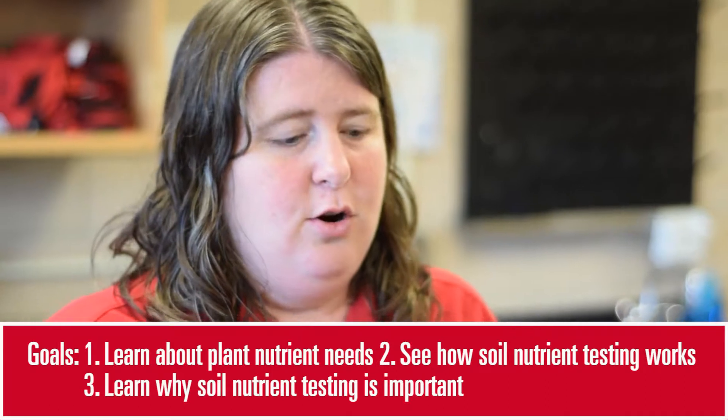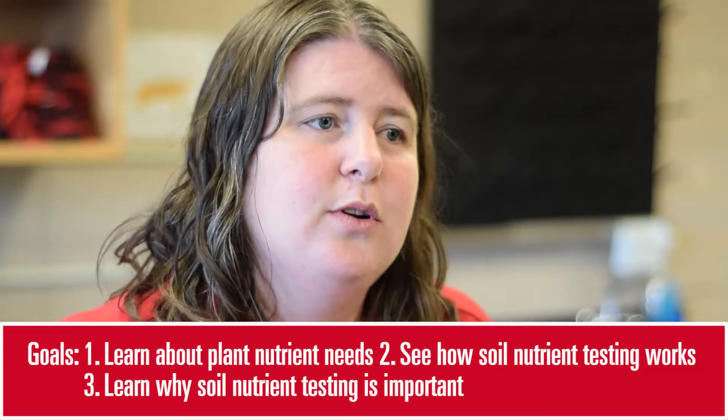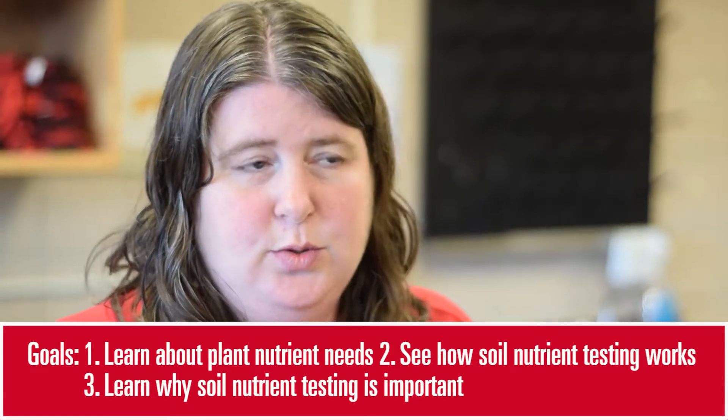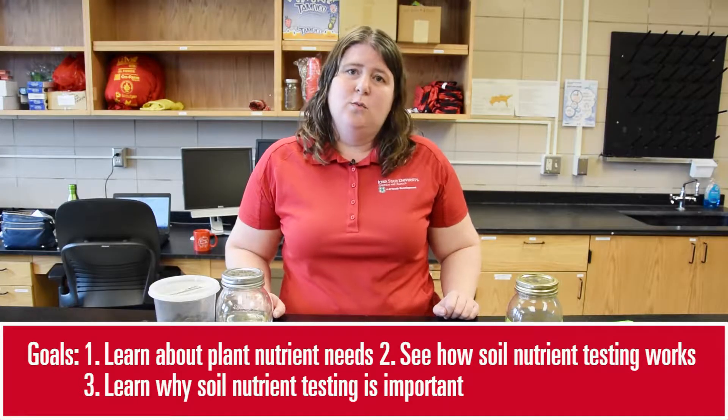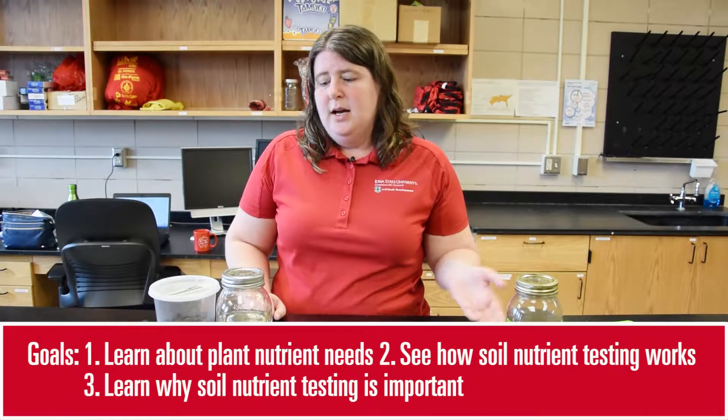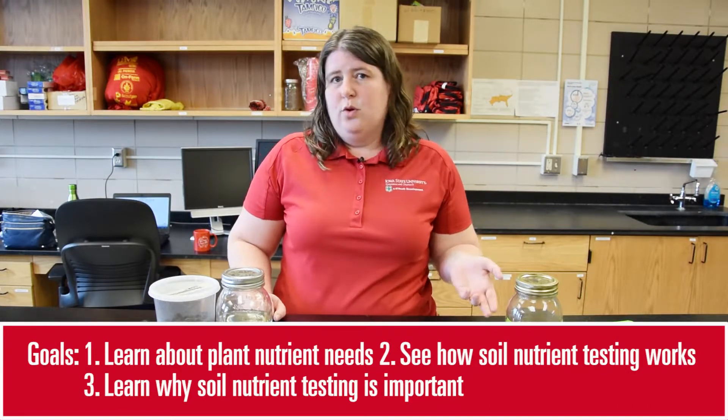Hi, my name is Maya Hazlett, and today I'm going to show you how to do a soil nutrient testing experiment. The goals of this experiment are for youth to learn a little bit about plant nutrient needs, do some exploration of how soil testing works, and then understand why it's important to do soil nutrient testing to grow good crops.